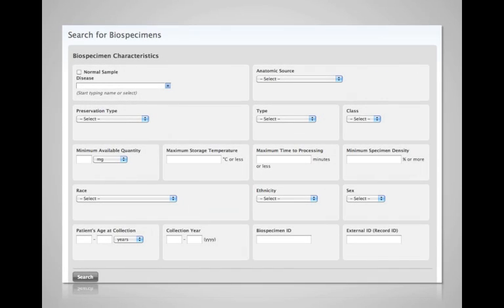We know the biobanking field is ever-changing, and more scrutiny is required on the data surrounding the biospecimen. BioLocator has dynamic search fields that allow you to create your own criteria to match your data structure. As your data changes, BioLocator adapts.